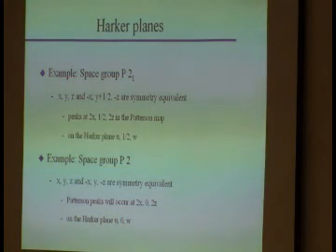So, once you plot this Patterson, you should be able to get some idea of which of these space groups it is, right? Just by looking at that plane and at that line and figuring out which of those actually has a decent number of peaks. So these Patterson maps really can help you a little bit further.